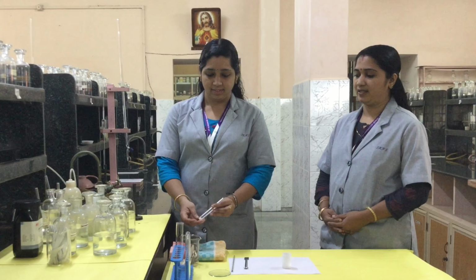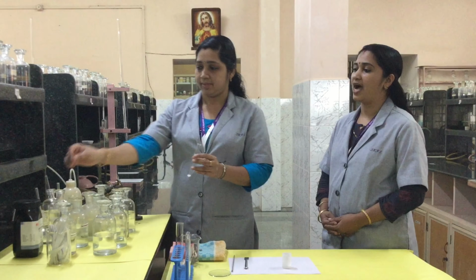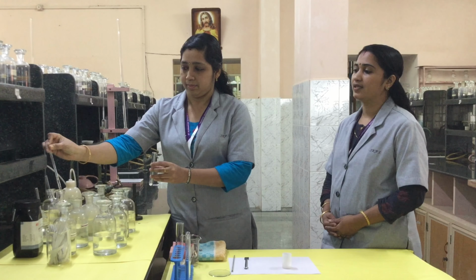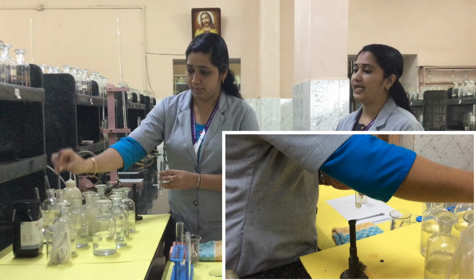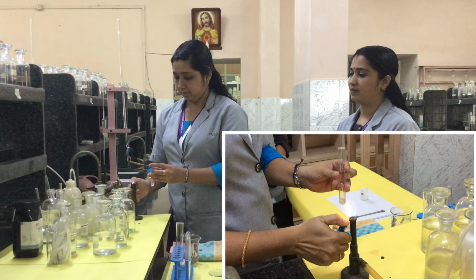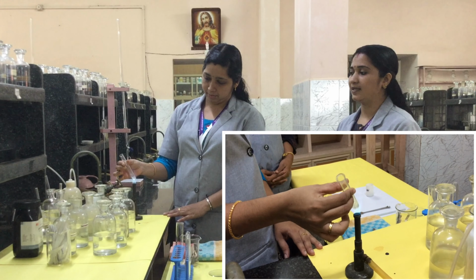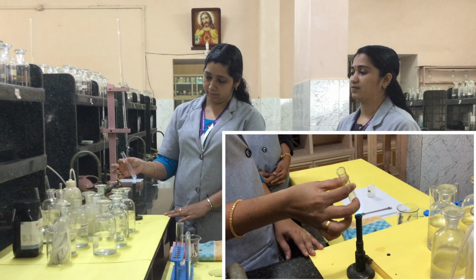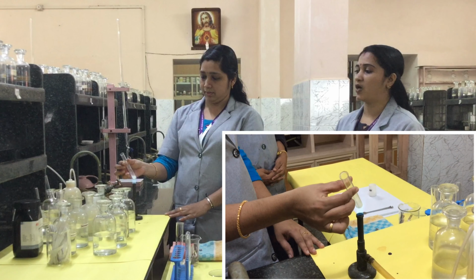Test for chloride. A little of the salt is taken in a dry test tube and concentrated H2SO4 is added. Two or three drops of concentrated H2SO4 are added. Then heat the test tube. Then observe if there is evolution of a colorless gas. There is no evolution of colorless gas.